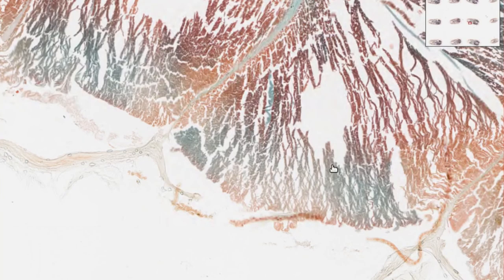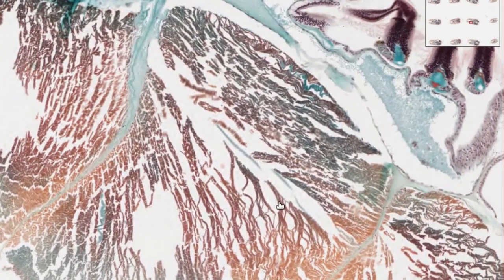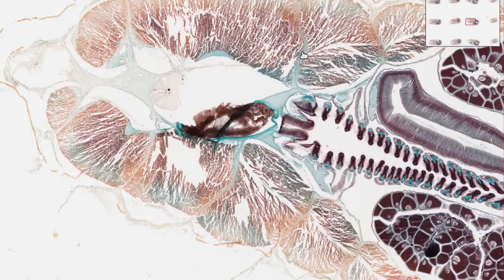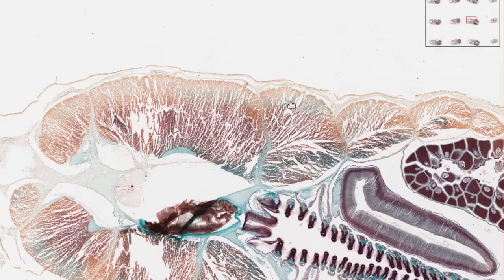So there's a nice band of muscle going there along the bottom of the branchiostome. So most of the muscle is up here. And this is the muscle that's going to be used for movement.